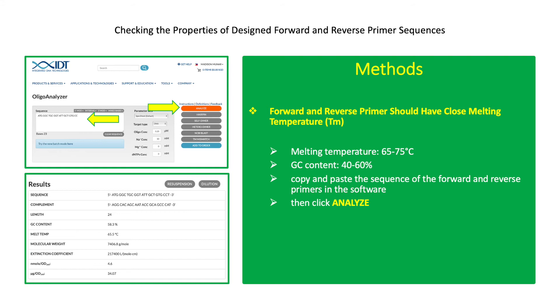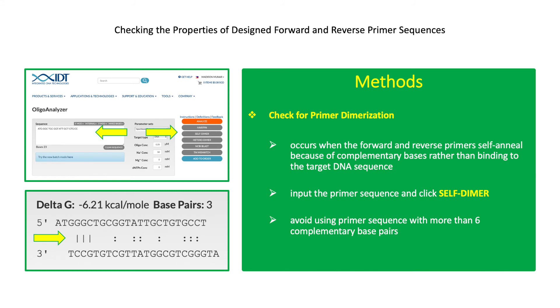Copy and paste the sequence of the forward and reverse primers in the OligoAnalyzer software, then click Analyze. Check for primer dimerization. Primer dimerization occurs when the forward and reverse primers self-anneal because of complementary bases rather than binding to the target DNA sequence. This may be prevented by increasing the annealing temperature on the PCR thermal cycling conditions and using less volume of primers in the PCR mix. Avoid choosing regions rich with repeating GC and AT bases, as this may cause self-primer dimerization. In OligoAnalyzer, click Self-Dimer, take note of the number of complementary base pairs, and avoid using primer sequences with more than 6 complementary base pairs.